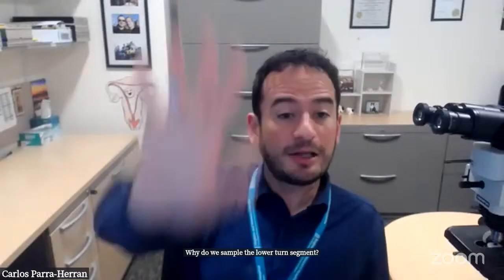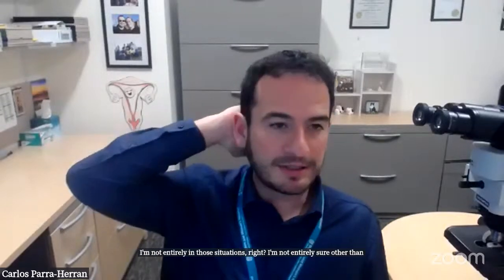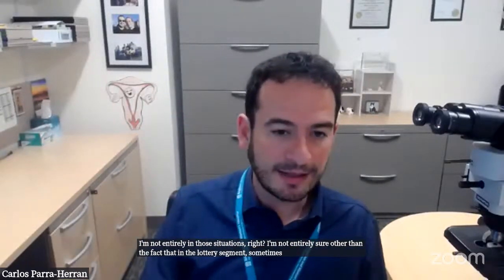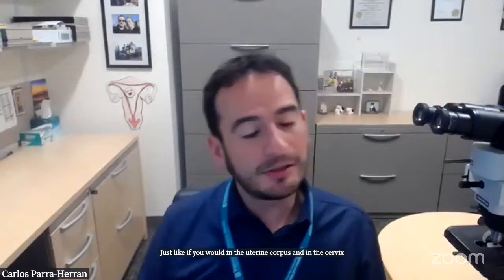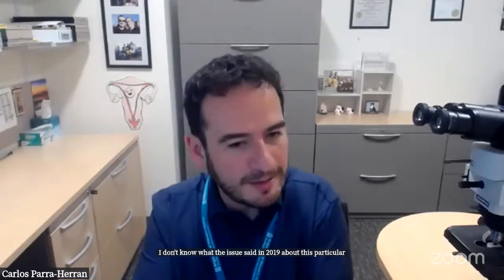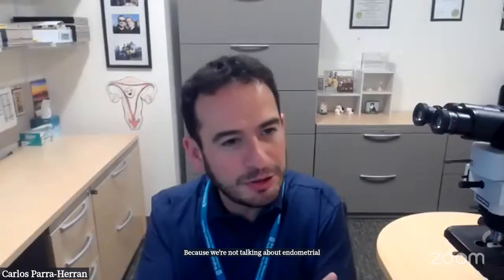Why do we sample the lower uterine segment? I'm not entirely sure, other than the fact that in the lower uterine segment, sometimes you find unexpected things, just like you would in the uterine corpus and in the cervix. I don't know what the ISGyP said in 2019 about this particular scenario. There's probably nothing about it, because we're not talking about endometrial cancer patients. What do you do? I'm not actually sure what our protocol says.